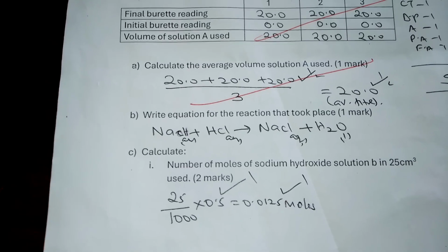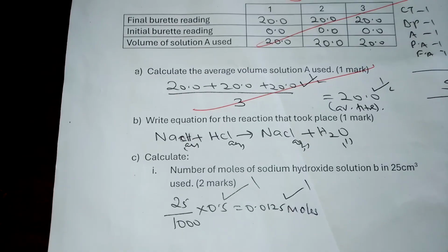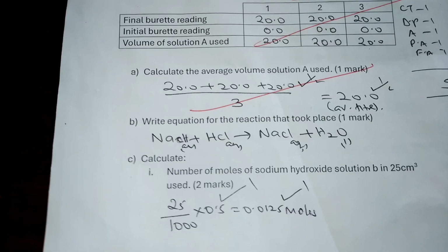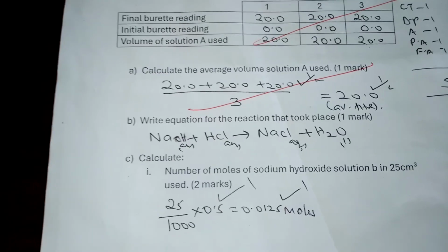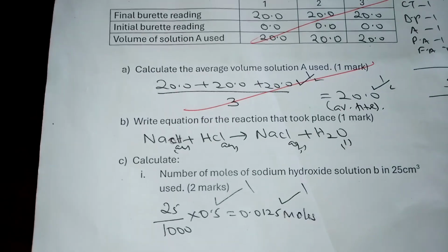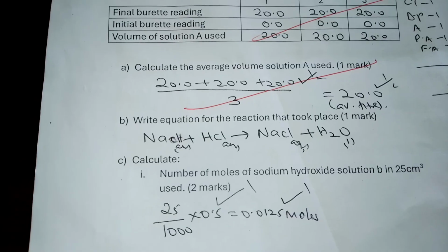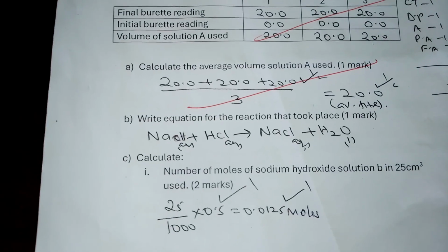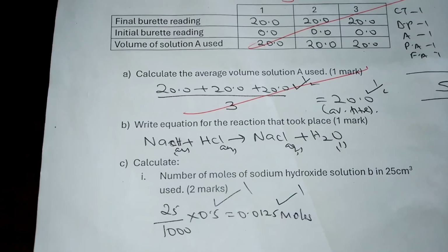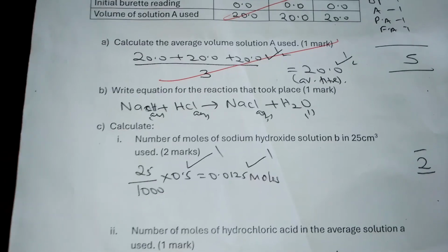So we need to ask ourselves, if 1,000 cubic centimeters has 0.5 moles, what about 25? And then we cross multiplied, and we got the final answer to be 0.0125 moles. So procedure 1 mark, and the number of moles that you got is another 1 mark. So those were 2 marks.